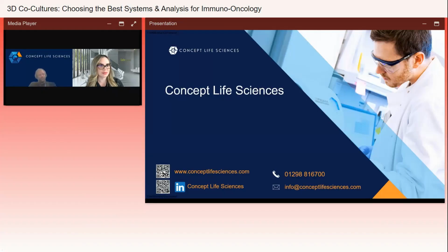Let's say immune cells, we've not had any issues with, but other cell types, I think will probably need their own support mechanisms. One of the other cell types I want to get in potentially is endothelial cells and see how they respond in these systems. And I know that we're going to potentially have to incorporate their growth factors in as well. But I'd say it's just a case of mixes of them seem to work quite well, or you can favor one over the other. So yeah, I'd say it comes down to experimentation there.